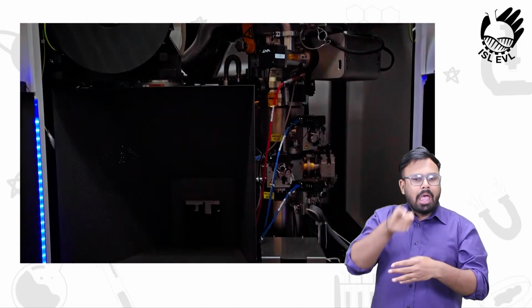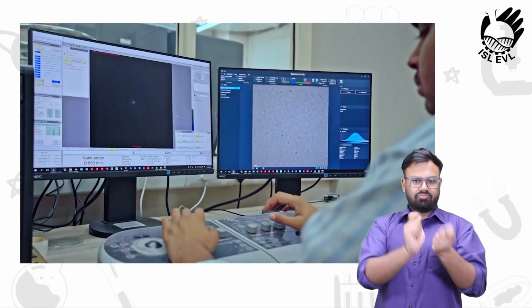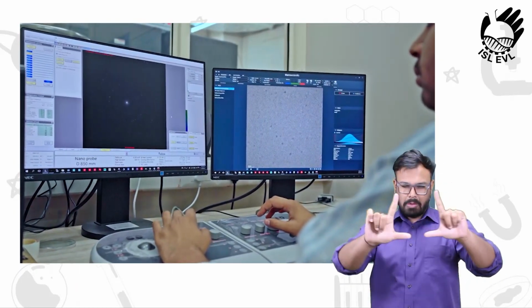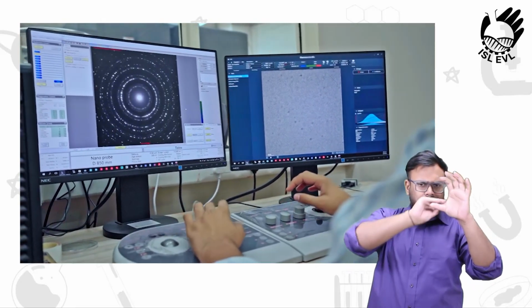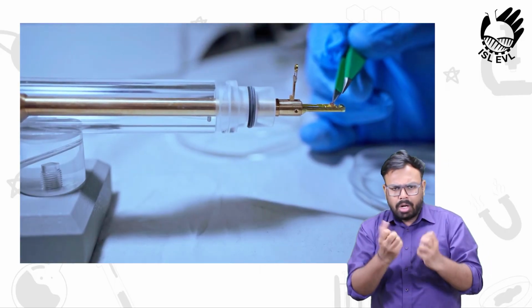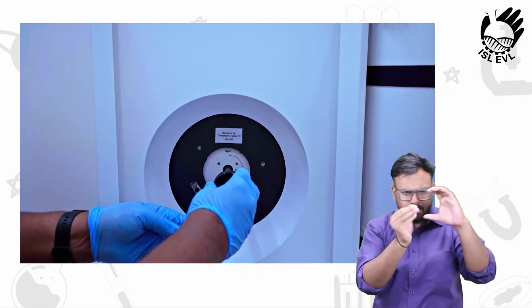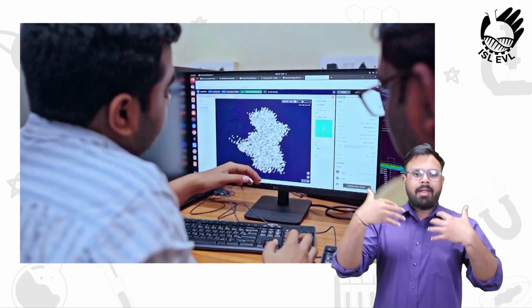So our goal is to look at a very high resolution, using cutting edge technology like electron microscopy, at the different molecular interactions that finally manifest into these nucleation processes, or how these different architectures of actin are essentially formed inside the cell, whereby we can then develop therapeutic molecules or drugs in future, which will help sort of cure some of these diseases.